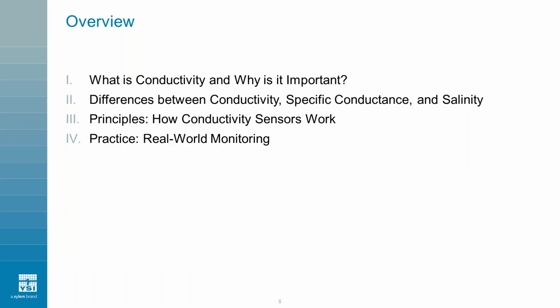Now, before we bring Zack on, I'd just like to quickly go over our agenda for today. We'll be discussing what is conductivity and why is it important, differences between conductivity, specific conductance, and salinity, principles, how conductivity sensors work, and finally, we'll be talking about real-world monitoring examples.